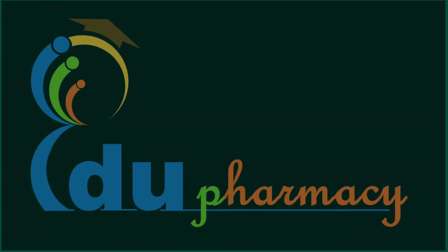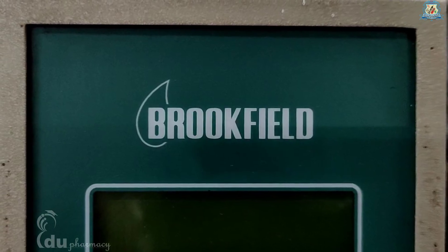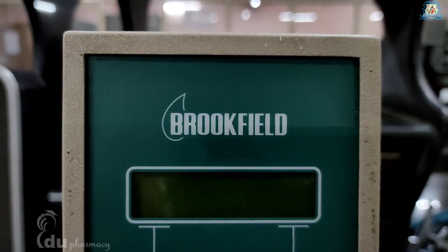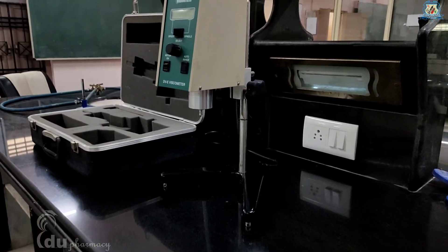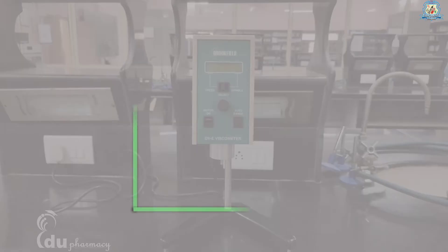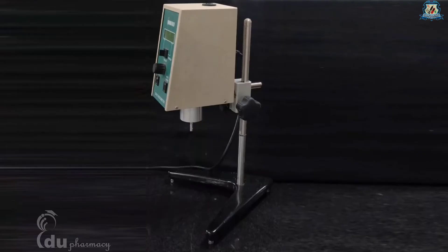Hello everyone, welcome back to channel EduPharmacy. Today I will show you how to handle or how to use the Brookfield viscometer. This video will demonstrate the standard operating procedure of the Brookfield viscometer. We have a digital LVDV-E model — it is a rotational bob type viscometer. This is a multi-point viscometer; you can use it to measure viscosity, get the consistency curve, or study the thixotropic behavior of any liquid or semi-solid sample.